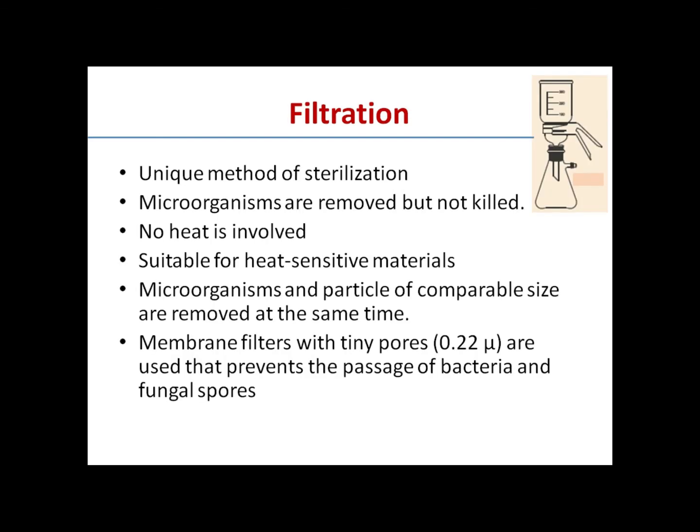substances. Then comes filtration. It's a unique method of sterilization. No heat is involved here. And one very important aspect of filtration is that microorganisms are not killed in this technique. They are just separated or removed.